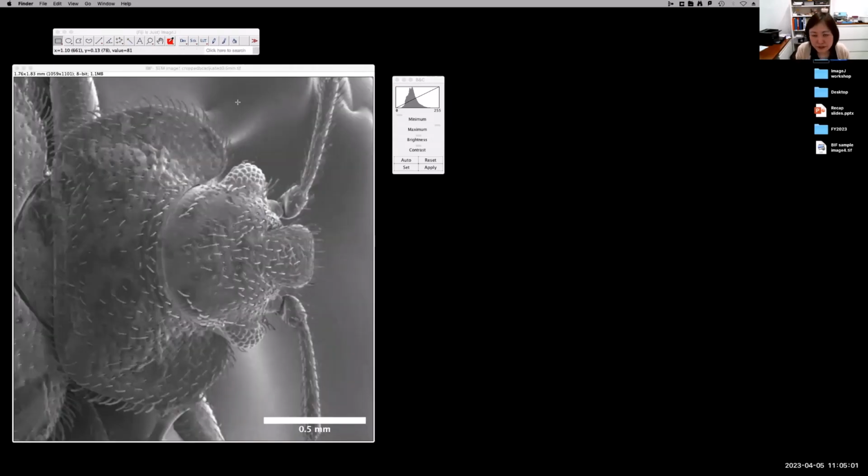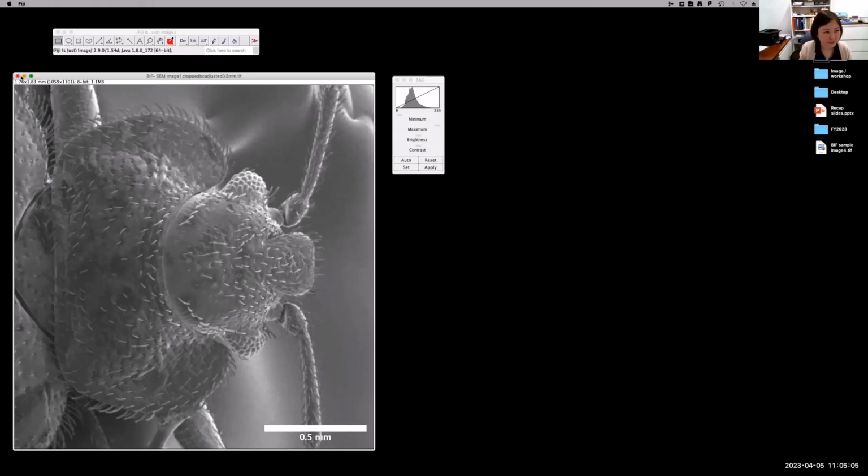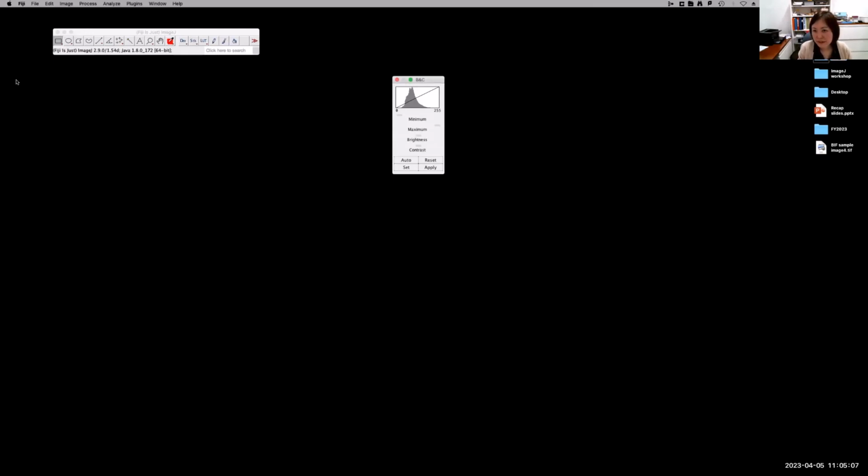Okay, so the first part is done. Should I check questions? Are there any questions about this first part of the image processing? Yeah, okay. All right. All the questions are answered.